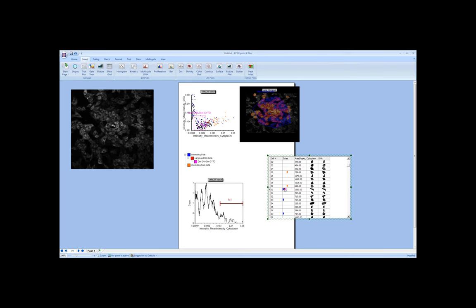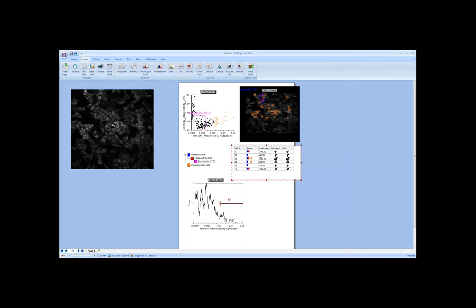If we wanted to find all of the individual cells that meet this phenotypic variant, we can apply this gate to the cell gallery and find all of the cells and the individual cutouts and the individual parameters associated with them. Again, if we just want to look at the interesting cells and maybe zone in on just a few of these cells, we can adjust these gates and move these things around. You can see that we have some statistics being displayed here, just like the raw data being shown within this data grid or cell gallery.